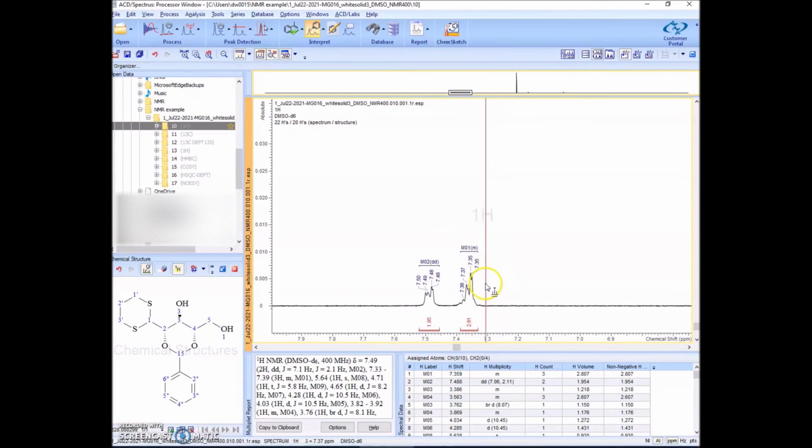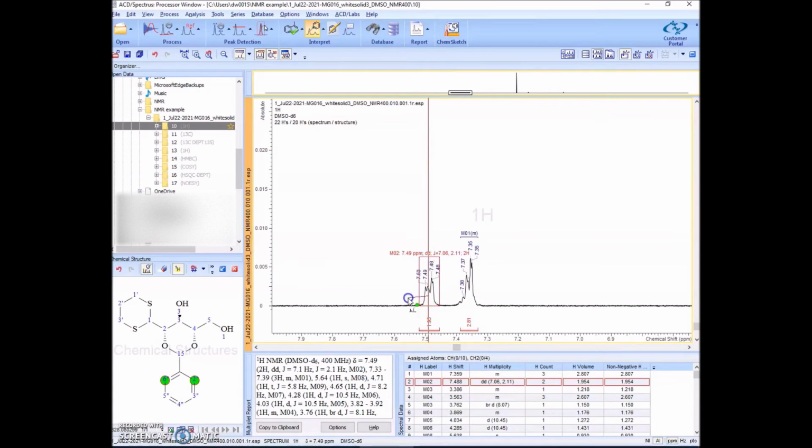So I know that these are the aromatics. I know that these 2 are the meta. So while I'm highlighted and I'm in this interpret mode, I can drag, so hold down over it where the little yellow dot is appearing, I know I can hold down and drag over to the structure. And it's already suggested for me that these two ortho protons are probably what this refers to, but I'm not sure if that's correct. I thought they were more likely to be meta.